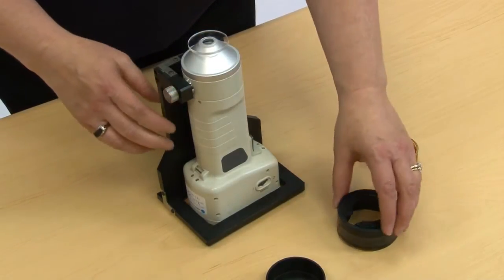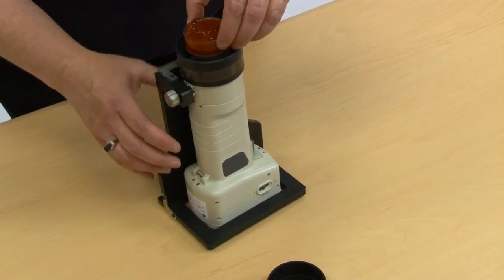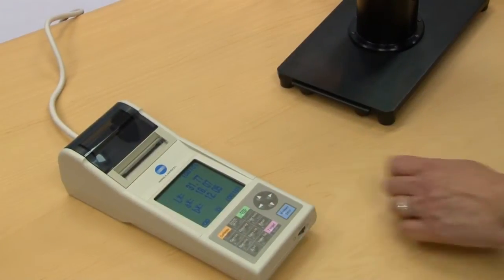This three-part video series will provide an overview on the most sought-after accessories and demonstrate how they are commonly used.